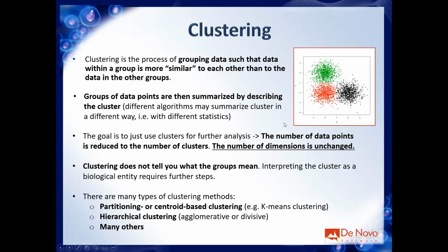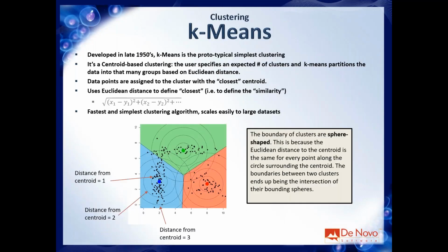So this is also easy when you want to explain K-means to someone else. But it's also a kind of limitation, because you usually don't really know how many clusters you have in your data set. But again, there is a solution for this as well. So overall, this is why K-means is so diffuse and so used.